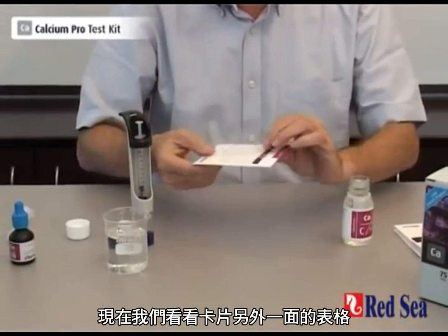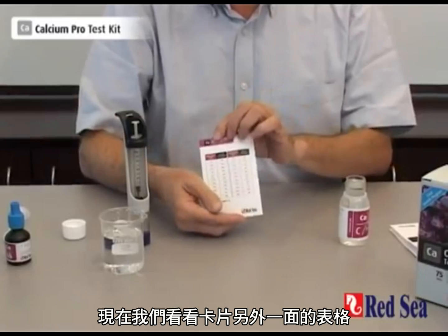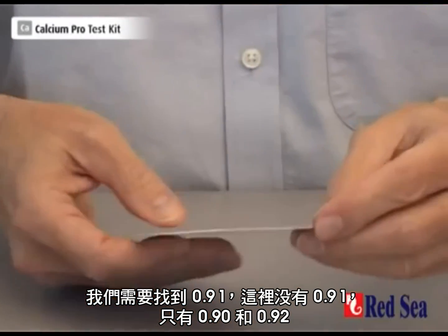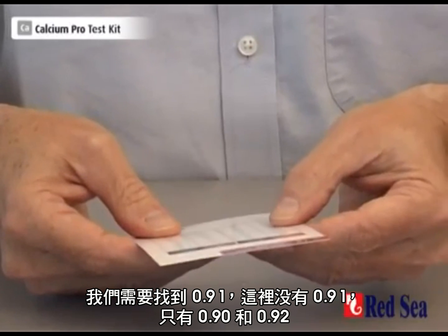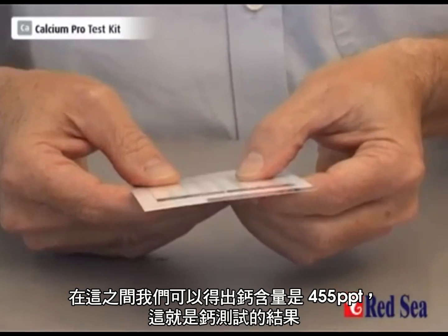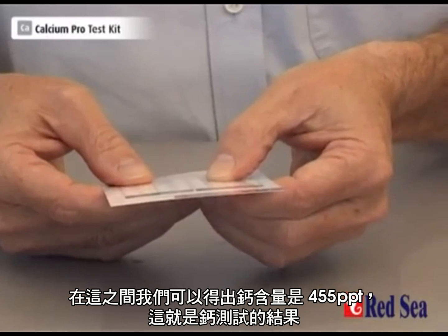Now we look on the card. We turn it over, and on the back of the card there is a table. We look for 91 — there isn't 91, but there's 90 and 92. The midpoint between them gives us a reading of 455 ppm of calcium.